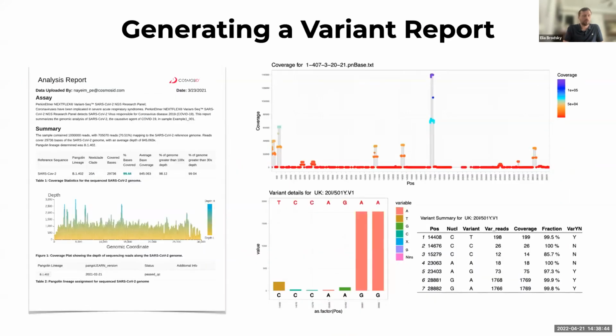We also worked with the LBRN core to help annotate and process a lot of the samples where the major question was annotation of variants of concern. And there we developed a full pipeline that automates identifying specific positions, annotating them based on the known variants and their classification, but also being able to generate intermediate reports to ask deeper questions.